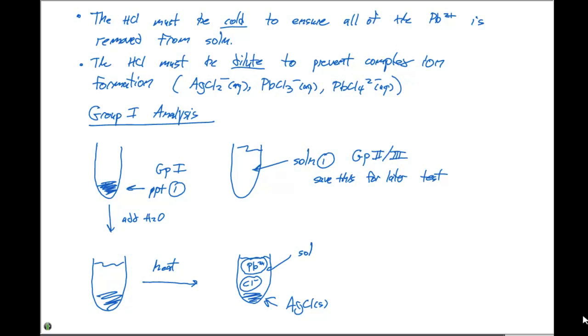So I'm gonna refer to this solution as solution number two. And the silver chloride we'll call precipitate two. We're also gonna separate each of these. So we're gonna decant the solution, which will effectively separate the lead and the silver.